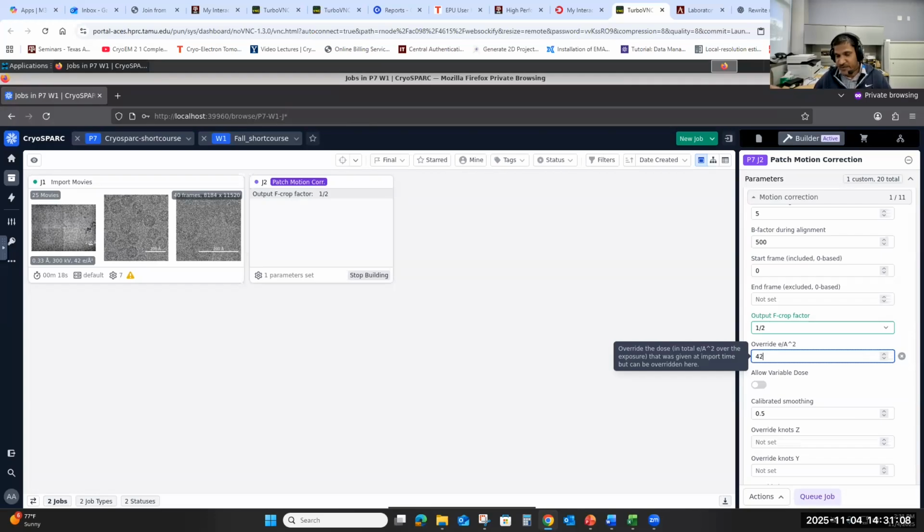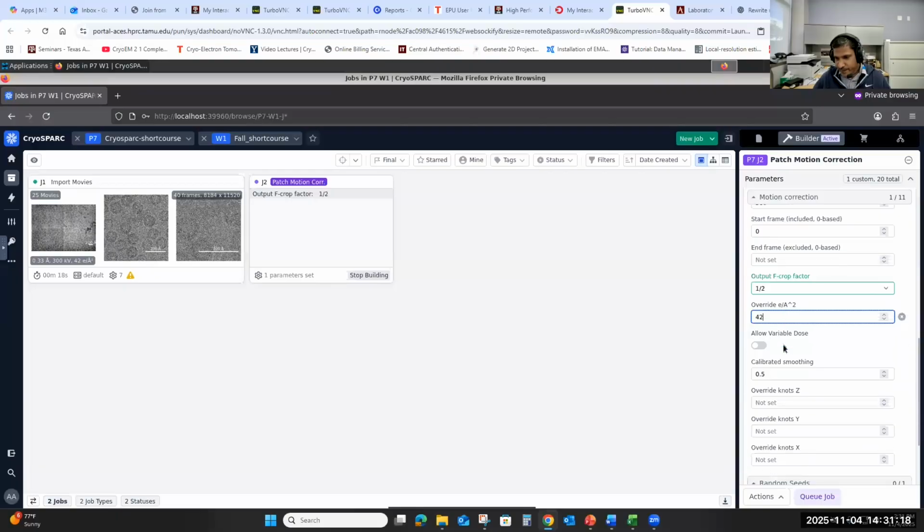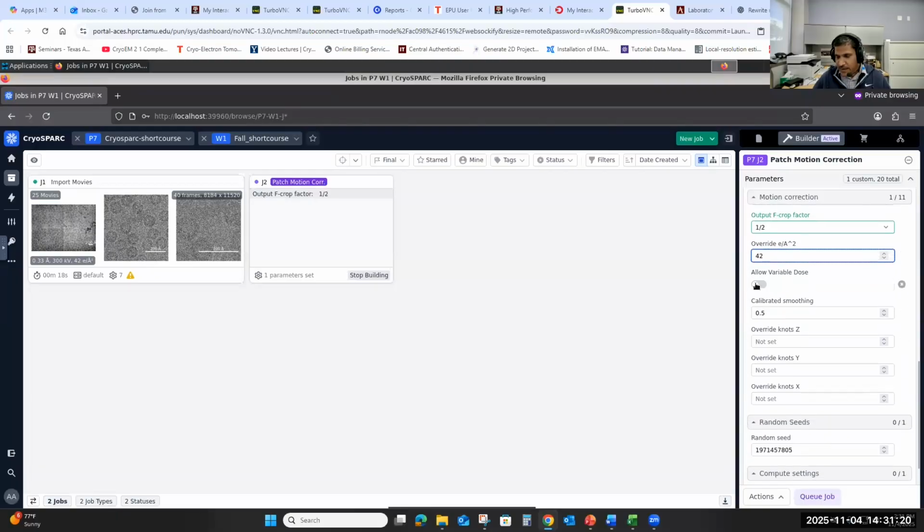These are what we call hot pixels, and they will be removed during this process. That will help you get a better noise model, so this is important as well.